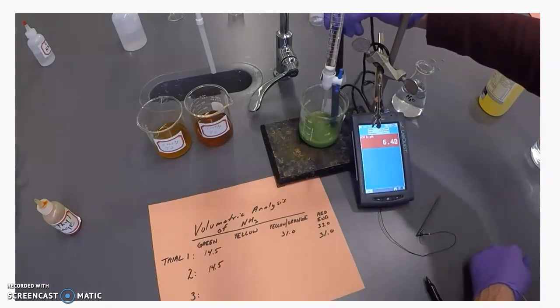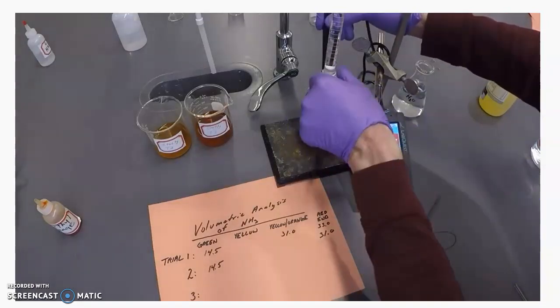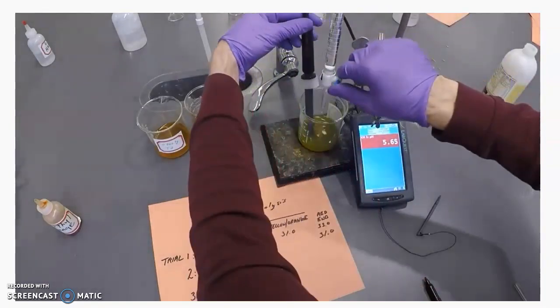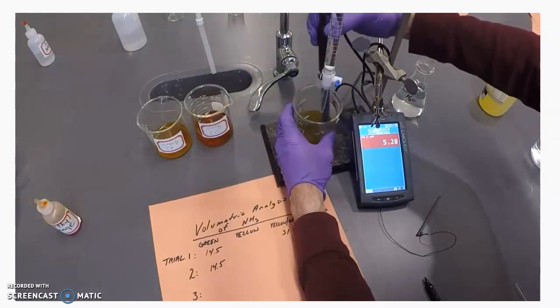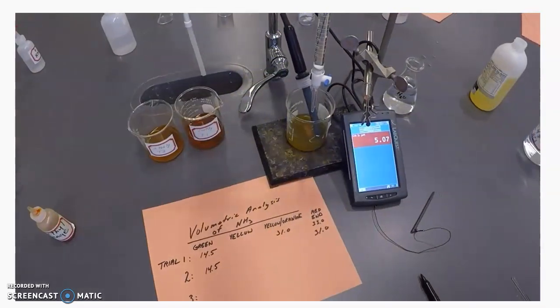So Mr. Davis is still titrating. It's going to start going a little bit slower now. You can see the transition of all the different colors. Starting to see a little bit of that orange. And the end point is right after the precipitate disappears, and it's kind of an orange red color.